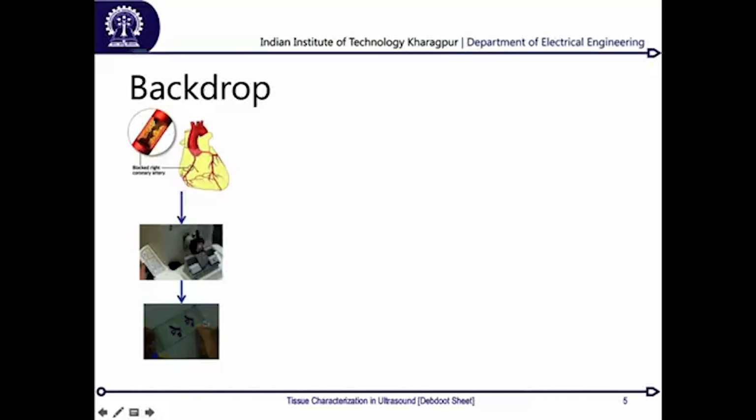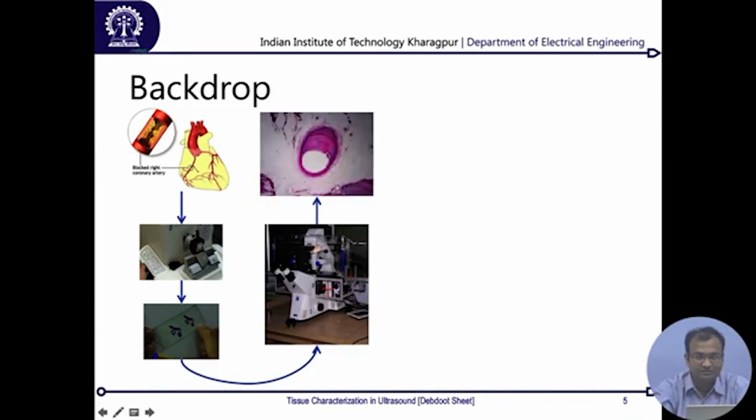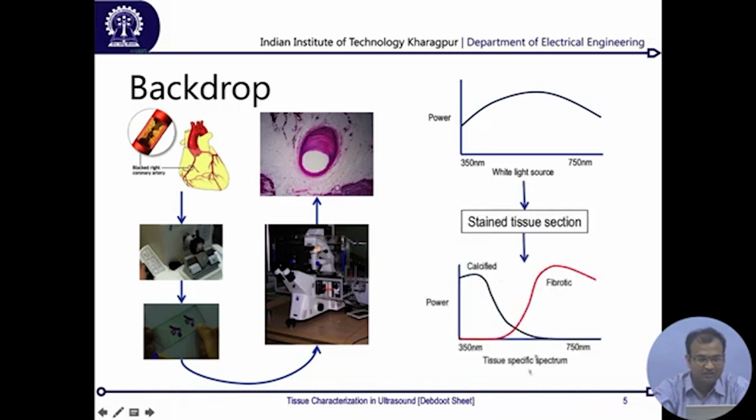Consider slicing of bread; over here it will be slicing of tissue, and we use a machine called a microtome to do that. Then you mount the slices onto a glass slide and stain them, and after that you look into a microscope and see something of this kind. Now if you look at it from the engineering perspective of a transfer function, on this microscope we are going to illuminate with white light, as we have learnt in the microscopy lectures. So you illuminate this tissue mounted on the slide with white light, and what you get on the response is something like this.